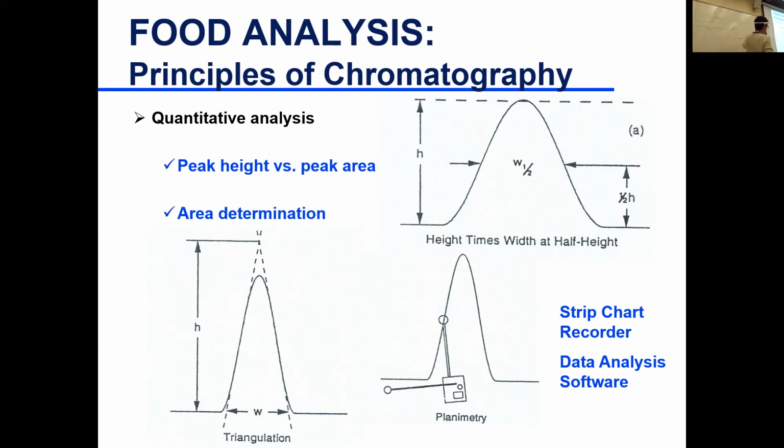Okay, so sometimes you say, should I take the height and relate it to concentration? Or should I take the area and relate it to concentration? So this is the height. Should I take the height only, or should I take the area? We go with the height. No, sorry, we go with the area. So why do we go with the area? Because the height changes with time.